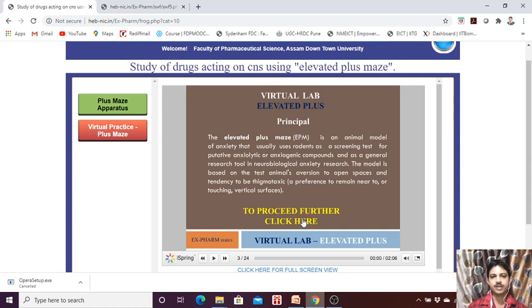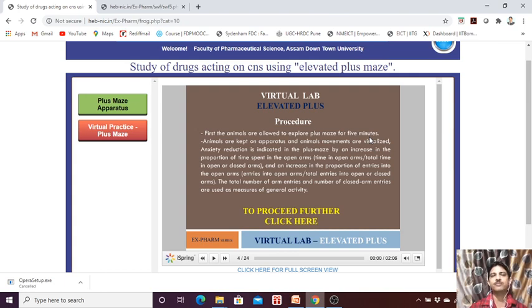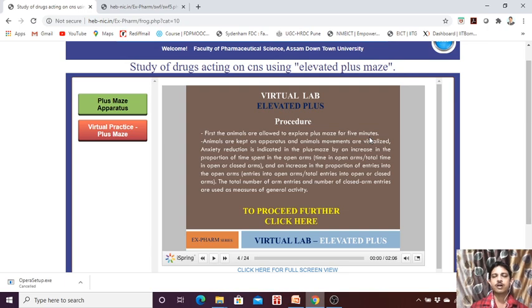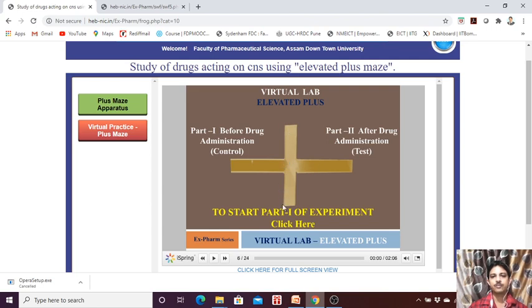Generally, we keep the animal to explore the maze. When actually doing the practical for research purposes, we first have to do a trial run. The animal does not know the maze — they have no idea about a new maze. So first we run a trial, and then go for the experiment. Since this is a virtual lab, there is no need for a trial run, but in real experiments we need to do the trial run.